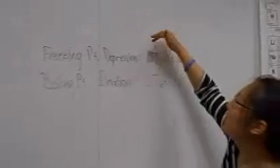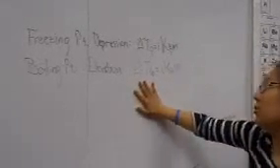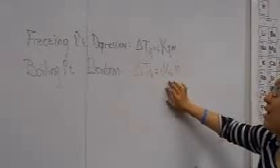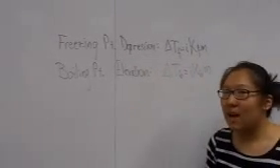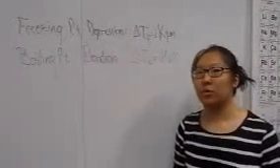Their formulas are: change in temperature is the number of particles times the constant times the concentration. Likewise, for boiling point, change in boiling point is equal to the number of particles times the constant times the concentration. In today's lab, we're going to prove that adding ethylene glycol to water is going to change the freezing point and boiling point.